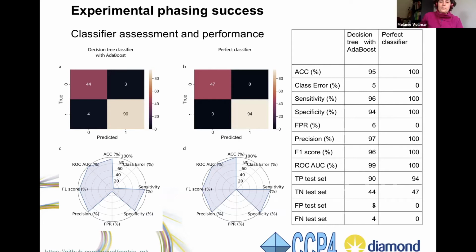In order to see how good that really is, I went off to one of my users and asked them whether they could provide me with some data that they recently collected, which is unpublished, so there's no risk that it is in my training data. They just tell me where the data is, I run my analysis pipeline on it and run the prediction on it, give them the results, and they tell me whether I was right or wrong.